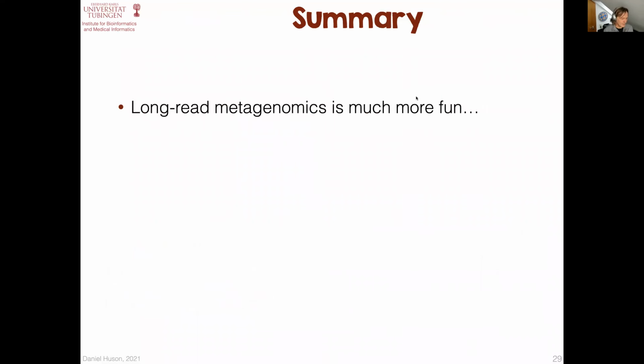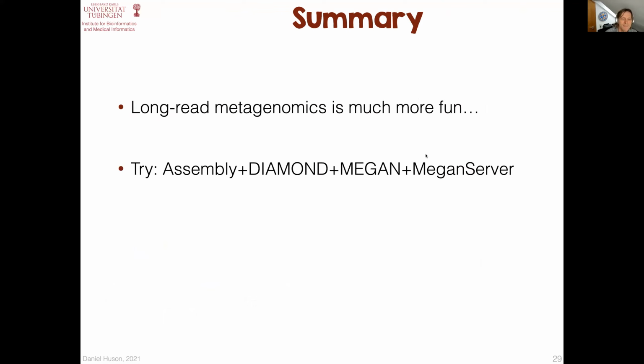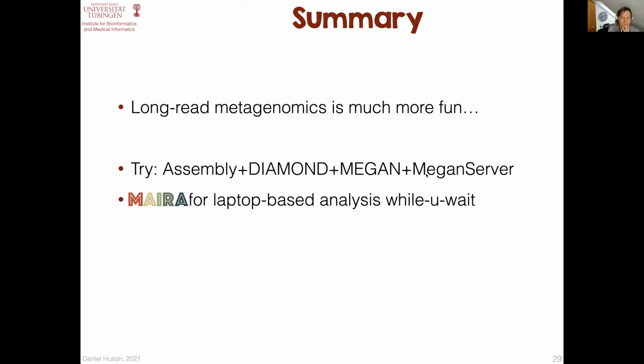Okay, so it's quite a short talk. For me at least, I like long-read metagenomics way more than I ever liked short-read metagenomics. I'm so glad that I don't have to deal with 100 million or a billion tiny reads that are assembled into tiny pieces. If you've never tried this pipeline, you could try using assembly followed by Diamond followed by Megan, and then put that onto Megan's server, and then open those files.